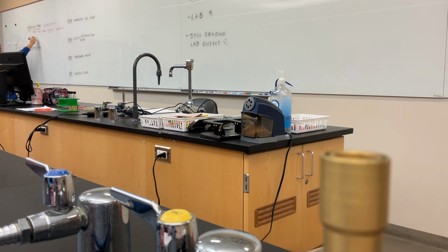With the way that we grow these target organisms, it's because they're going to have selected food types in them. We talked about before with nutrient agar how it had carbs and lipids and nucleic acids and proteins. A little bit of something for everybody. I mentioned it was kind of like a salad bar. These don't have that. They only have selected food.